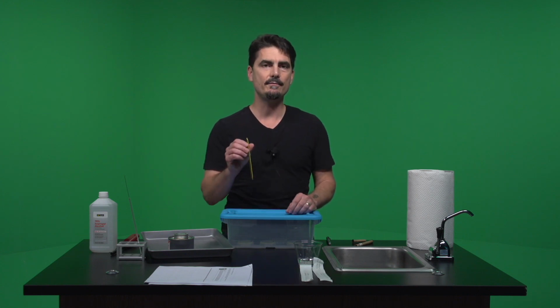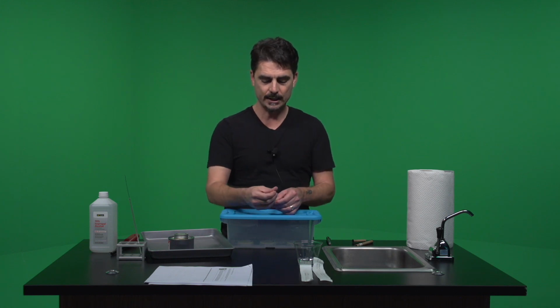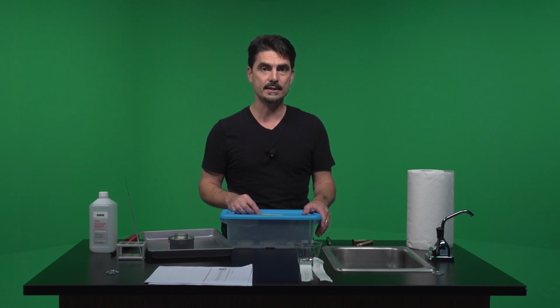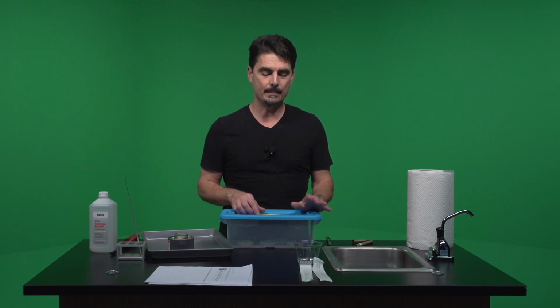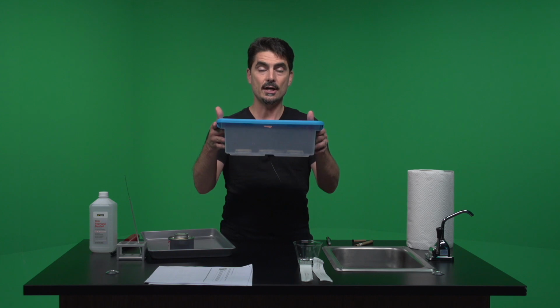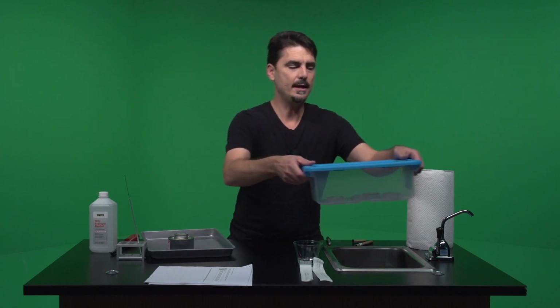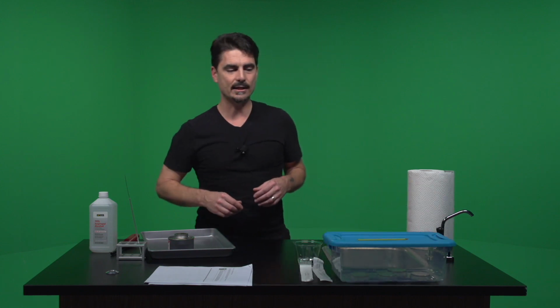And then the lab tells you to go ahead and, wherever you're going to put it, make sure that the temperature is between 21 and 25 degrees Celsius, which is one of the reasons why you've got this thermometer. So what I do is I just put it on top, I make sure that it's between that, and actually if it gets up to 30 degrees Celsius, that's even better, okay? The reason why they don't want you to do it higher than 25 typically is because if you were to just put these plates somewhere higher than 25, the plates will start dehydrating. But if you've got it in a container like this, you could go as high as 30 degrees and still within 48 hours your plates will not dehydrate if you made them correctly. So let's go ahead and put this in some safe spot in your house, right, where you need to go. And then in 48 hours we will be back to look at the results on that.